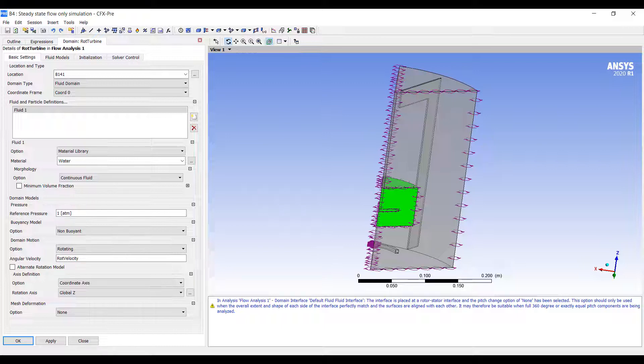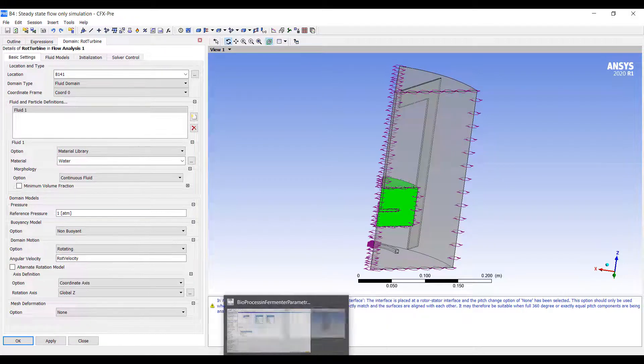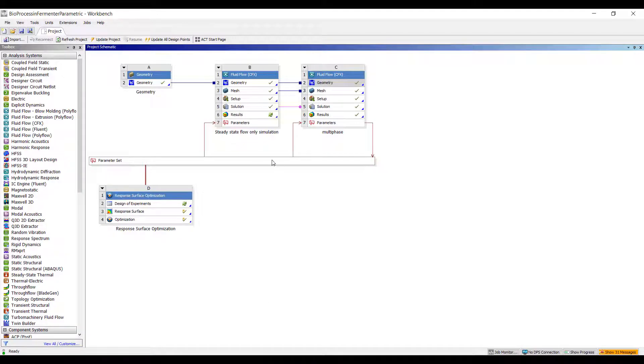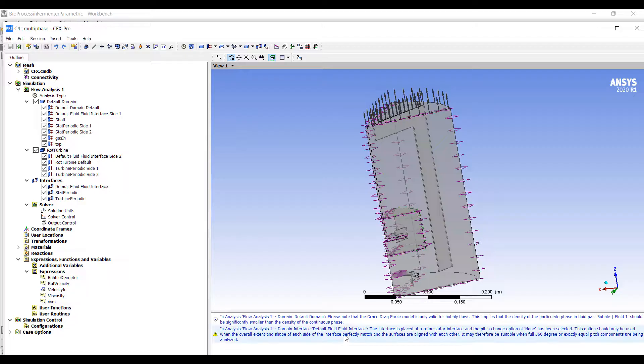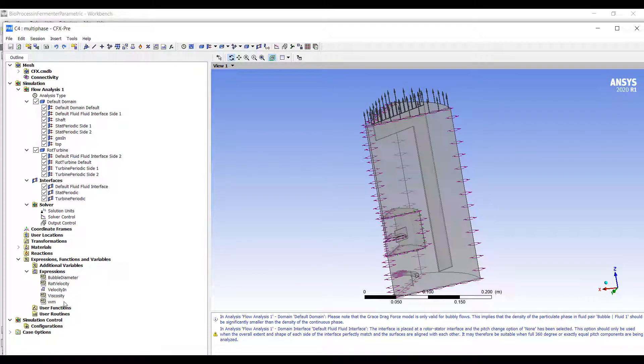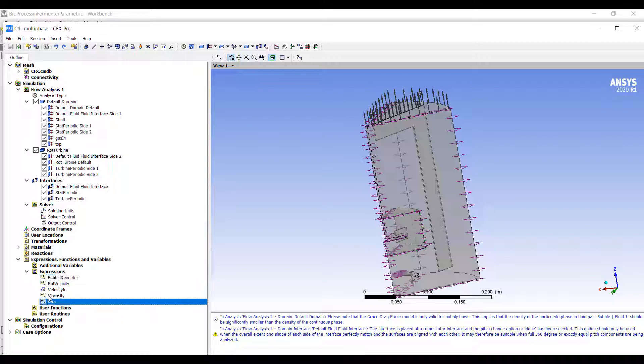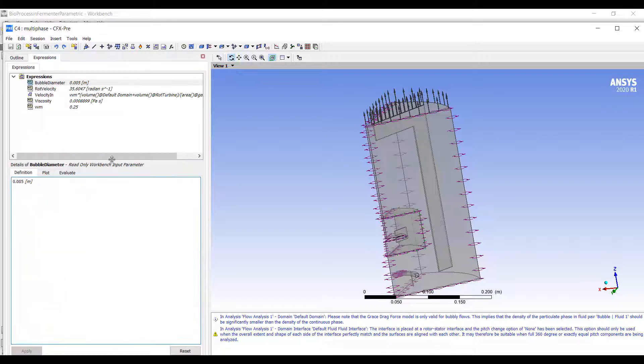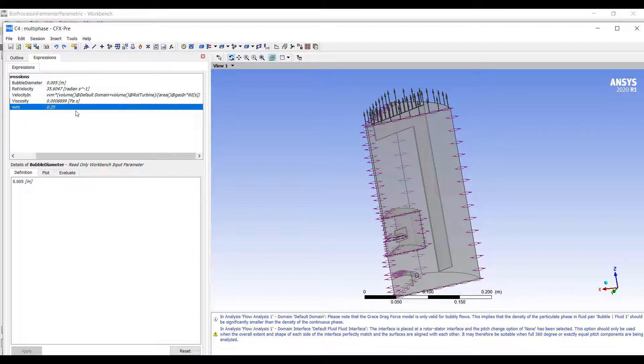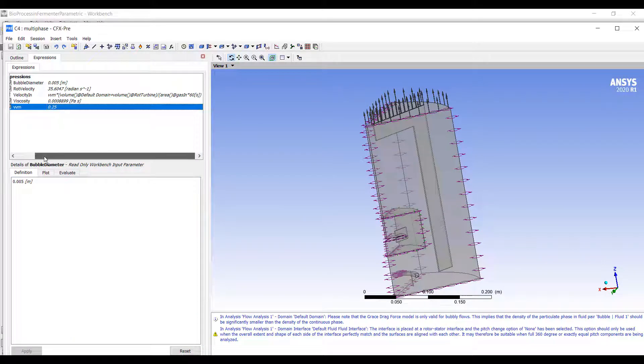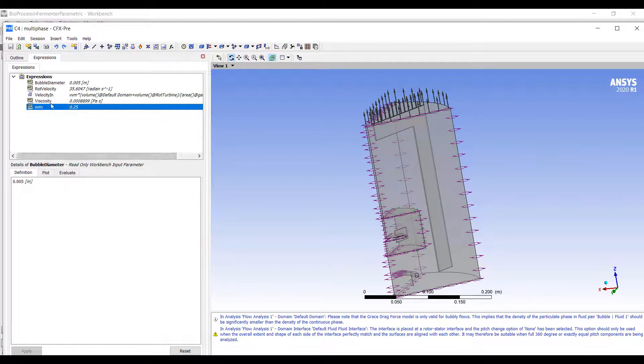The reason I did this was because I also specified the same set of parameters in the multi-phase analysis. In my multi-phase analysis we have the same parameters for rotational velocity and viscosity, but I've also added a bubble diameter and a volume per minute parameter. You can see I have all of these parameters.